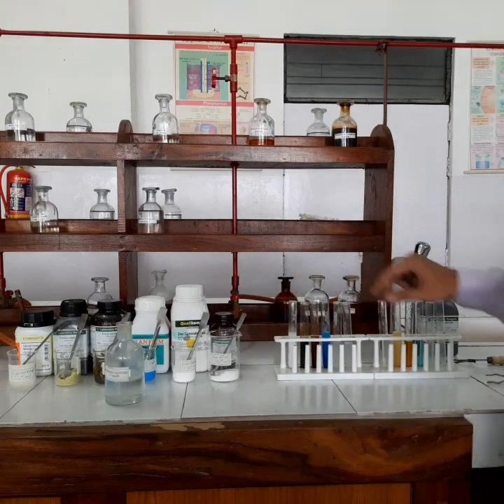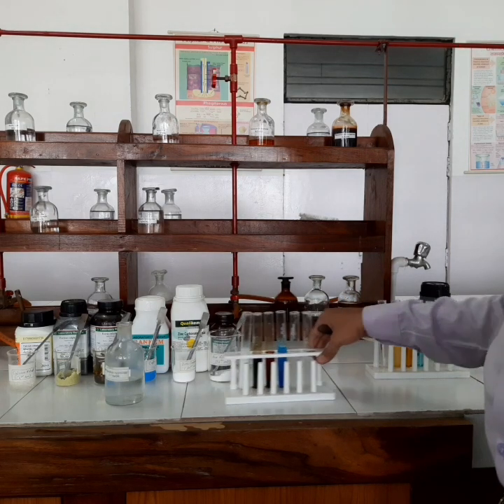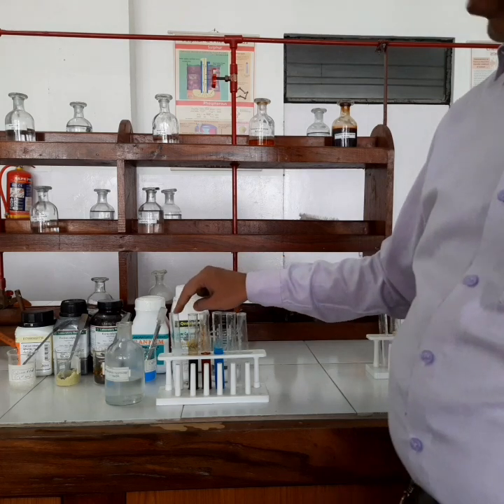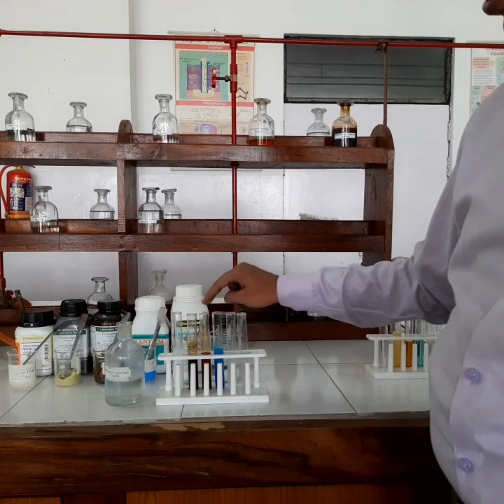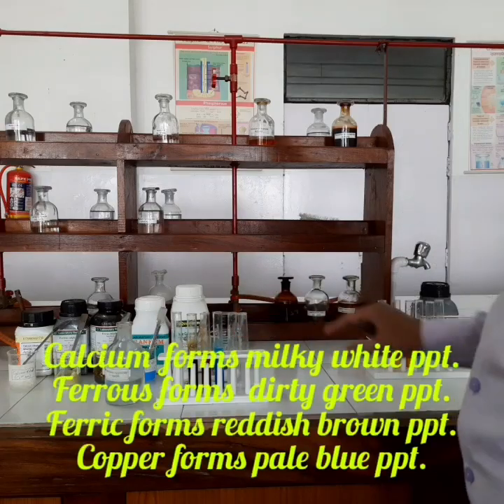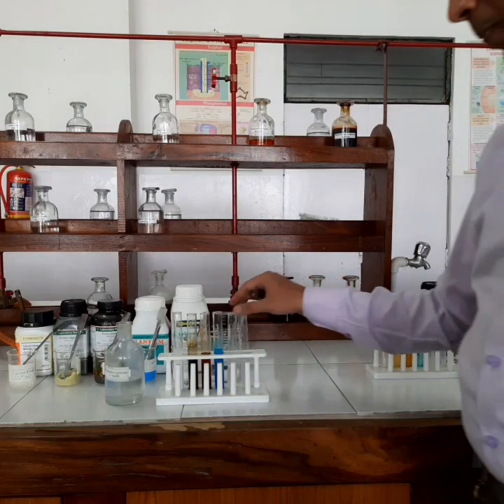So all these 4 ions, that is calcium, ferrous, ferric and copper, form their hydroxides, which are white in color for calcium, dirty green for ferrous, reddish brown for ferric, and pale blue for copper. And all these hydroxides are still insoluble in excess of NaOH also.